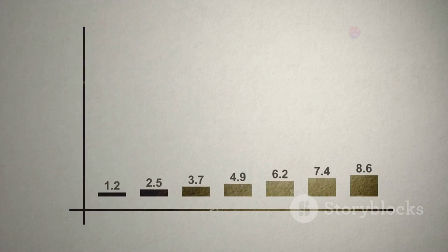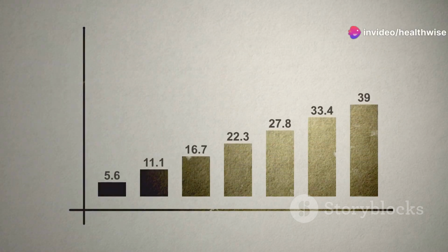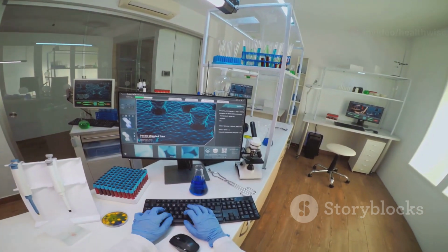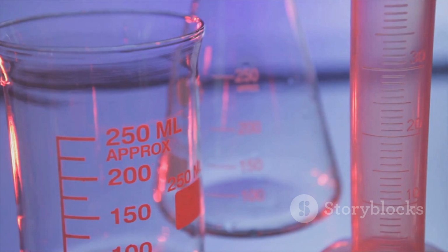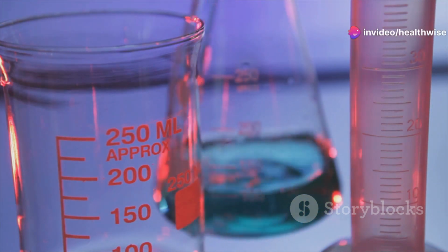They should form a straight line. If the line starts deviating at high concentrations, determine the limit of linearity from the point of deviation. The relationship between absorbance and concentration holds true up to this limit. From this curve, you can create a table showing the concentration of glucose against each absorbance unit.